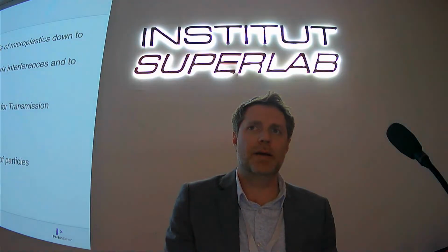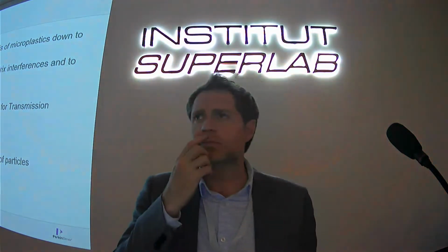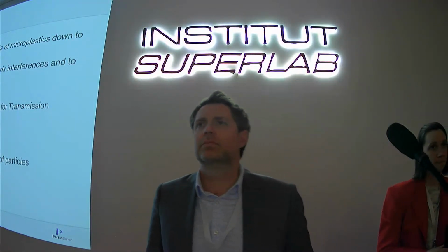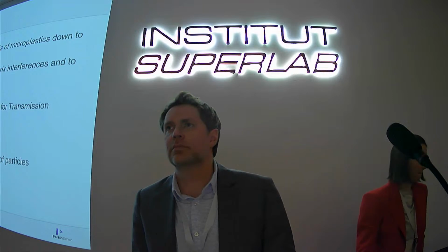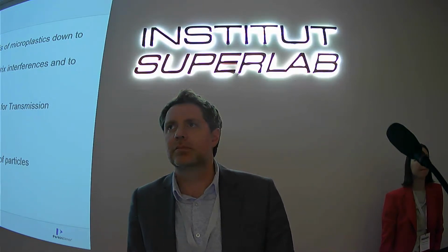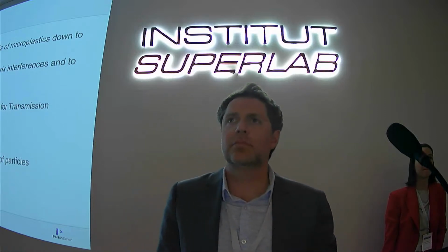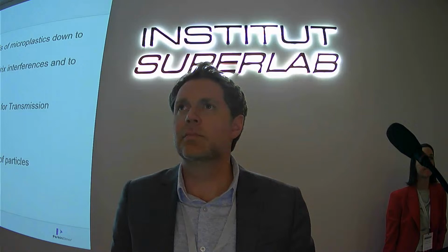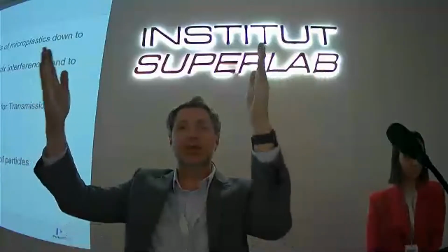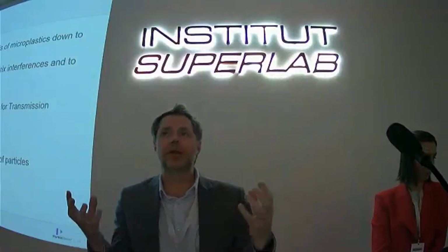I think there was a question at the back. Thank you very much for a good lecture. We got a lot of information from you. I have a probably technical question. When it comes to fibers, which mode would you prefer and suggest? Because what we have seen in our results, then you have more intensity, so you can do that larger array even faster. But it just depends on the type.